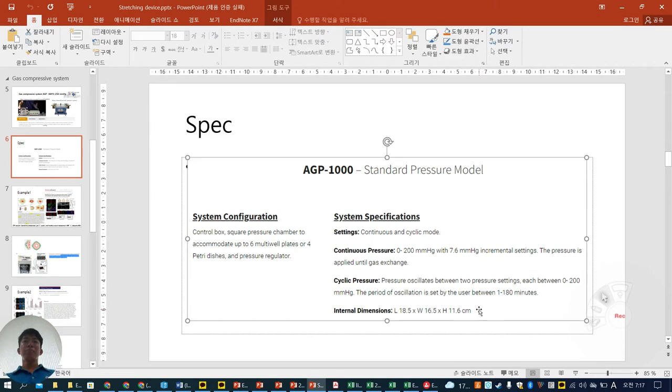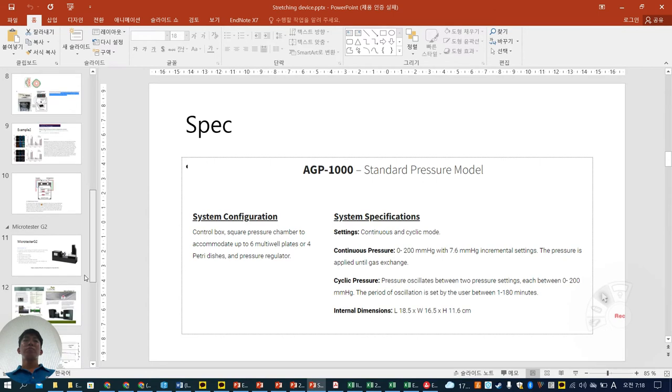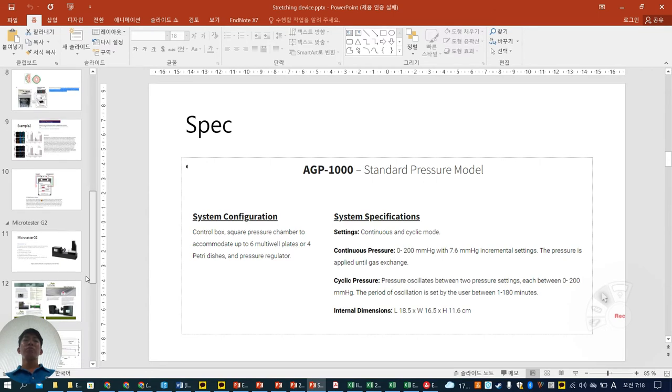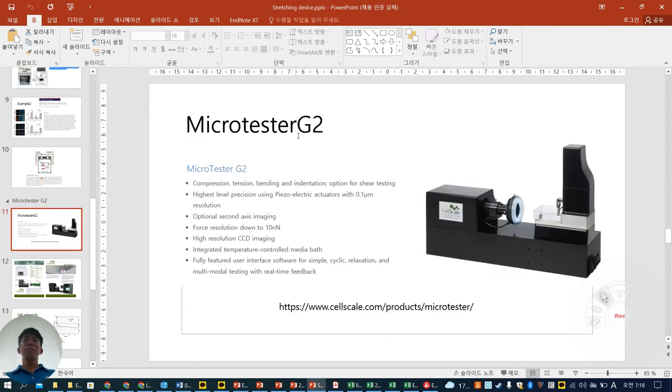그게 조금 더 이렇게 프로그램 해가지고 디지털로 하려면 이 장비 자체를 완전 바꿔야 됩니다. 뉴메트릭 시스템을 쓰든지. 네, 가격이 저 정도지, 천만 원대. 네, 근데 일본이 만들었으니까 좋을 건 좋을 거예요. 웰 자체를 좀 우리가 원하는 대로 디자인해가지고 할 수도 있겠네. 샘플 크기 좀. 오케이, so next one is micro tester G2.